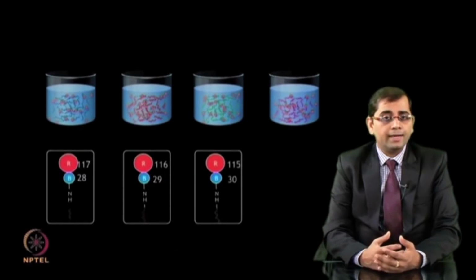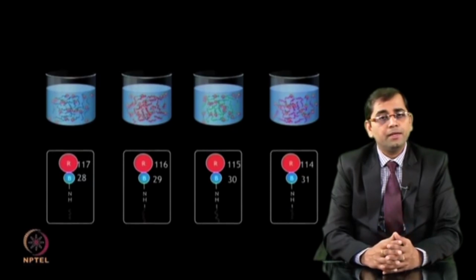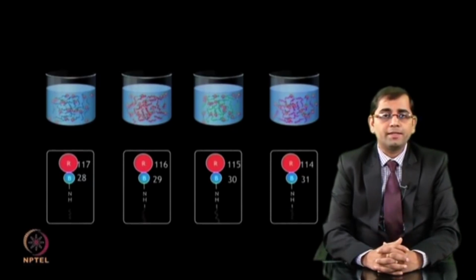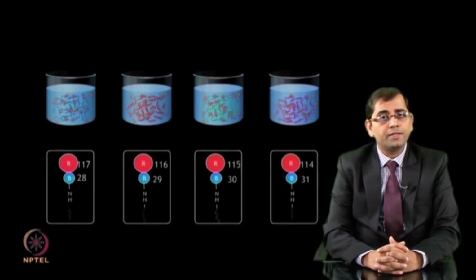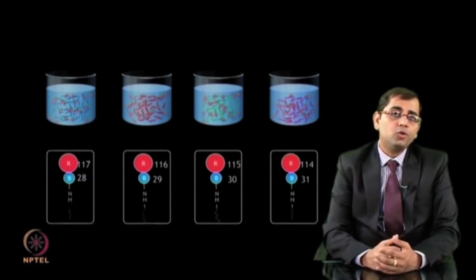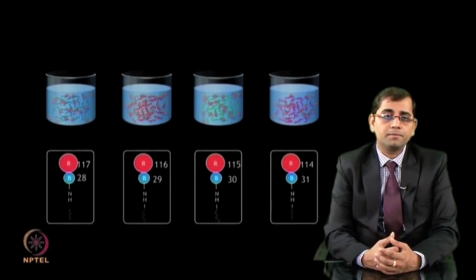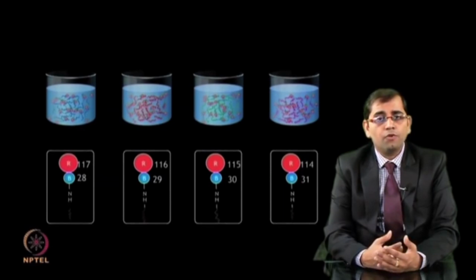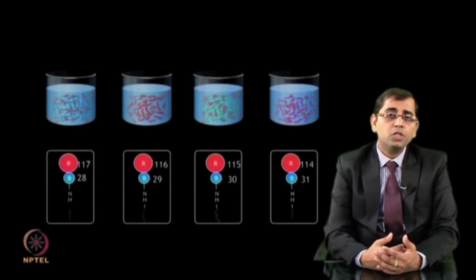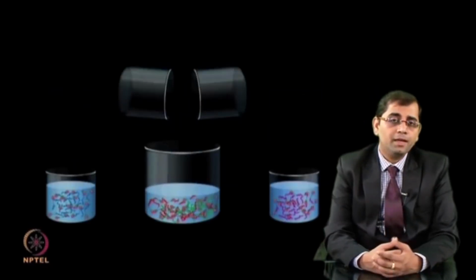iTRAQ involves identification and quantification of complex protein mixtures by MS-based quantitative proteomic techniques. The iTRAQ reagent consists of an amine-specific stable isotope reagent which can label peptides of up to 4 or 8 different biological samples. The iTRAQ method provides multiplexing capability of 4 or 8 sample analysis, which is not possible using ICAT, where only 2 samples can be labeled and analyzed.